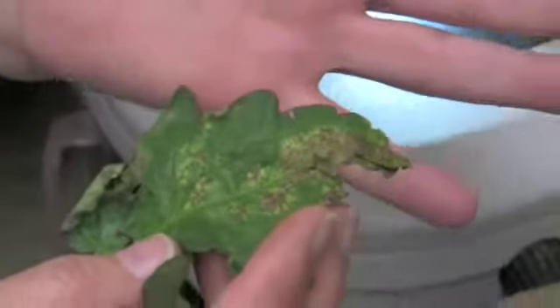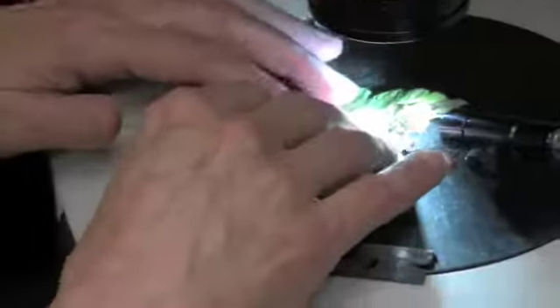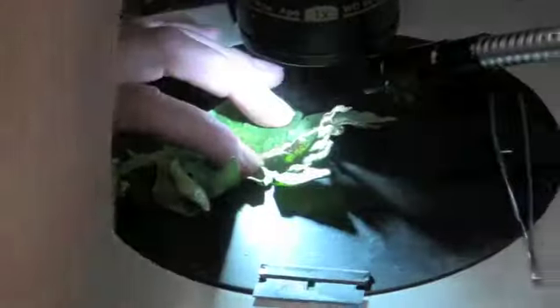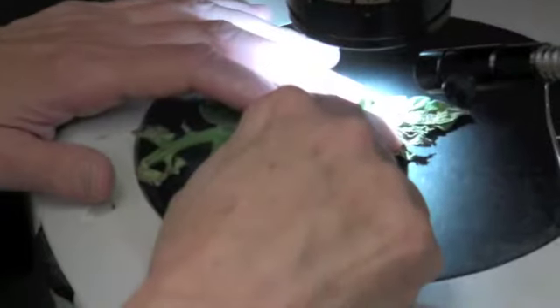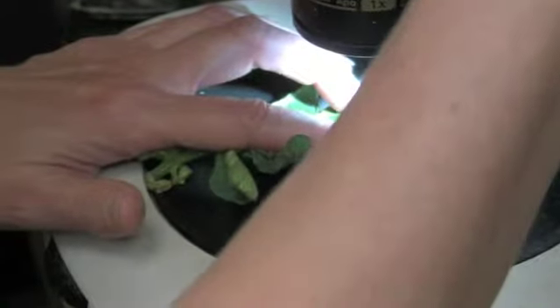Bob, what we're looking at here are these little tiny specks on this tomato leaf. And the first thing we're going to look for is evidence of fungal infection through the stereoscope, which gives us a moderate amount of magnification. And we might want to change the lighting and double check this. And I am not clearly seeing evidence of fungal infection at this point.